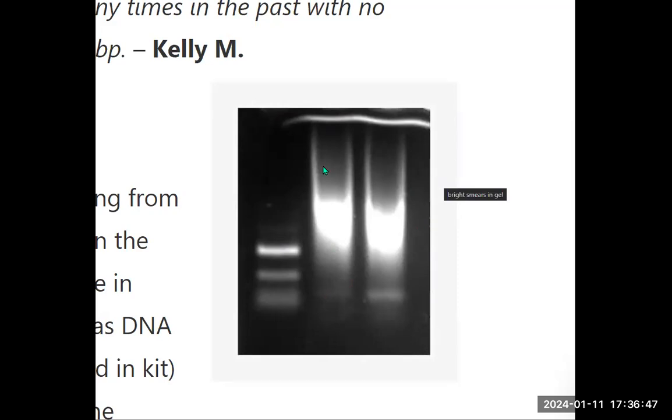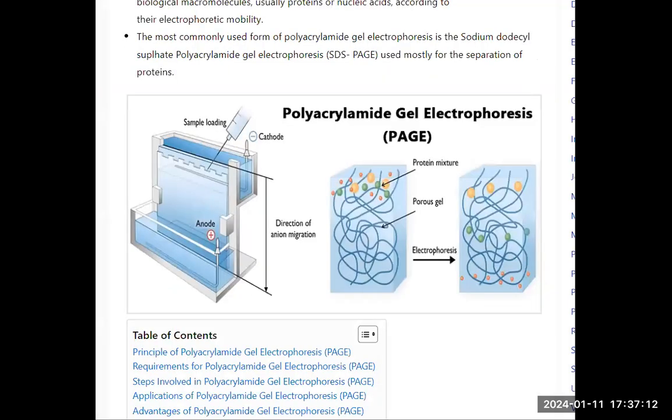These columns show that when contaminants were introduced during preparation of our agarose gel, there's a tendency for our bands to become smeared. So is this acceptable? This is unacceptable. Okay. So what else? Oh, method.